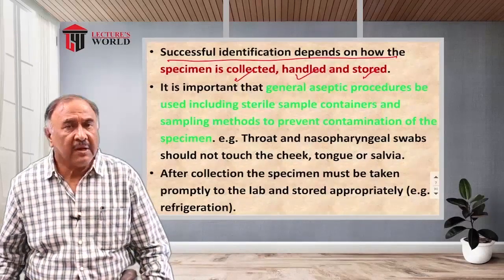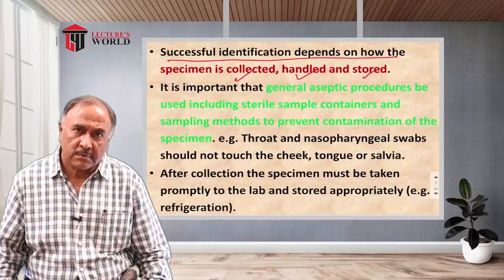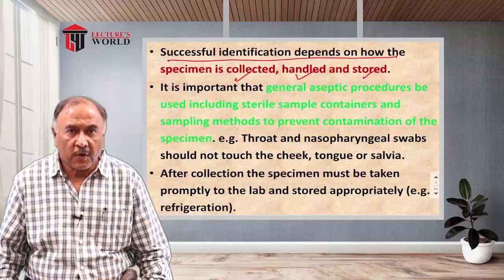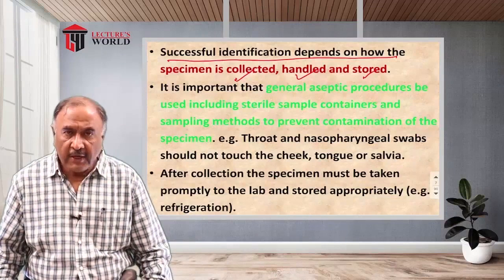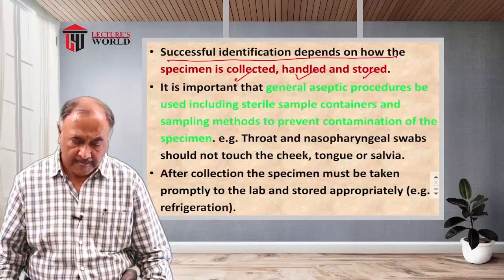Now, I will exemplify these procedures by giving you a few examples. First, the use of gram staining. Staining by gram staining is the primary staining method.